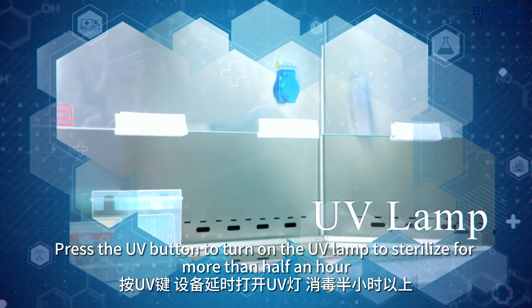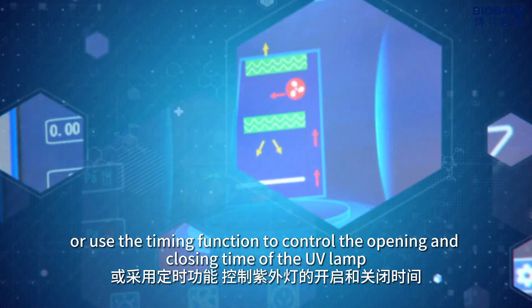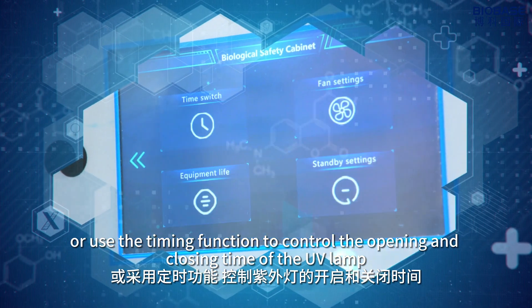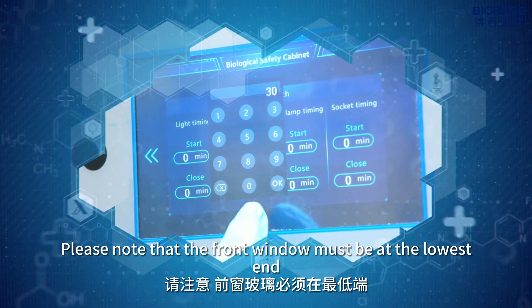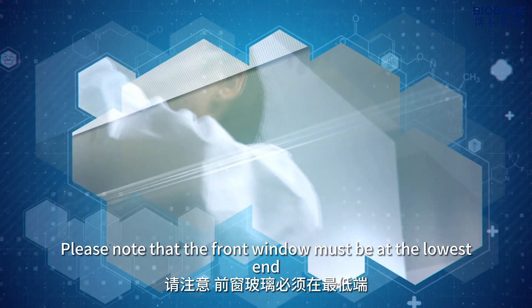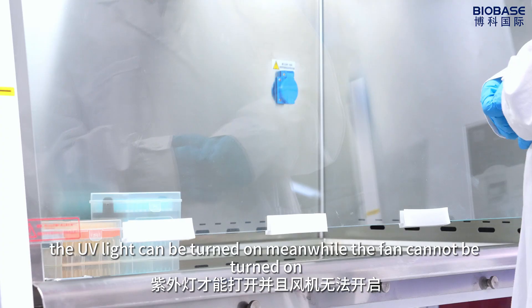Press the UV button to turn on the UV lamp; sterilize for more than half an hour. Or use the timing function to control the opening and closing time of the UV lamp. Please note that the front window must be at the lowest end. The UV light can be turned on, but the fan cannot be turned on simultaneously.